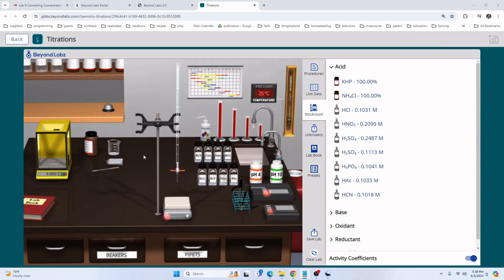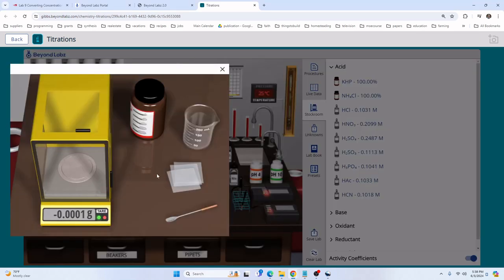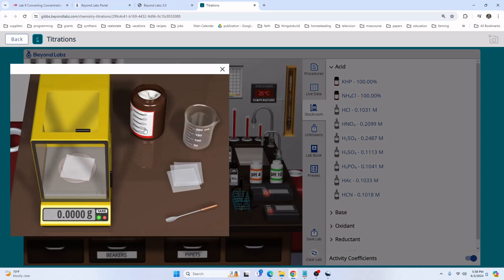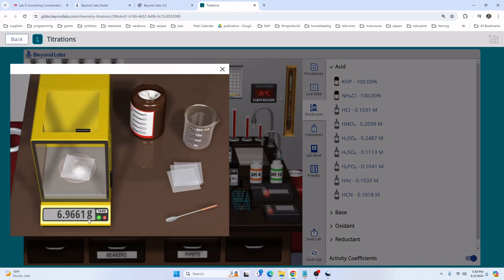We'll begin by zooming in on the balance. You'll see some weigh paper there. Let's go ahead and pull one to the balance and click Tare to remove the mass of the weigh paper from our calculation. We have sodium bicarbonate here next to the balance. We'll open the container and weigh seven grams of sample. We'll choose the largest spoon and drag it to the weigh paper seven times — one, two, three, four, five, six, and seven — giving us approximately seven grams.